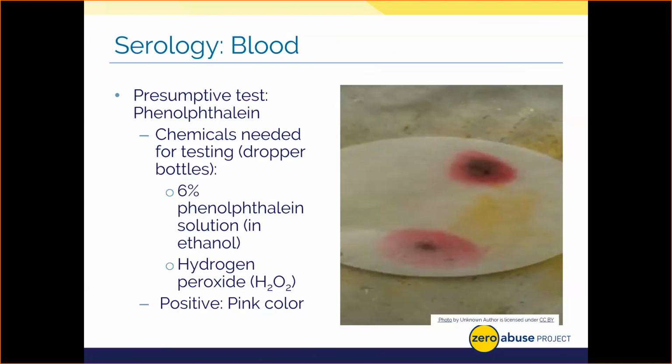Now, using that small subset of sample, the analyst adds a drop of the phenolphthalein and then a drop of hydrogen peroxide. If positive, in other words, if the sample is possibly blood, you're going to get a pink coloration as a result. I also want you to understand at a basic chemical level how the test works. Phenolphthalein and hydrogen peroxide are colorless before we use them on a stain. However, if heme is present, meaning that blood is potentially present in the sample, the heme will give electrons, and electrons are one of the three basic components of an atom, if you recall from basic chemistry, to the peroxide. To compensate, the blood takes electrons from the phenolphthalein chemical, which causes it to turn pink.